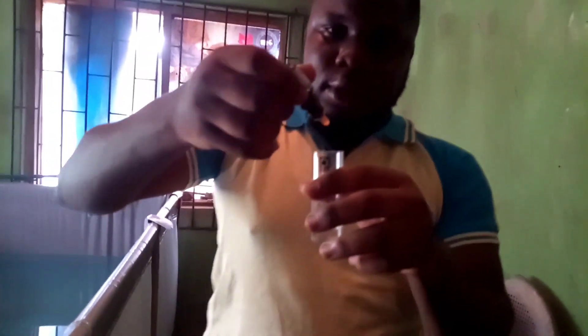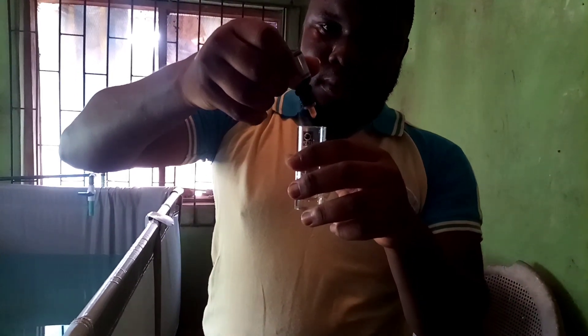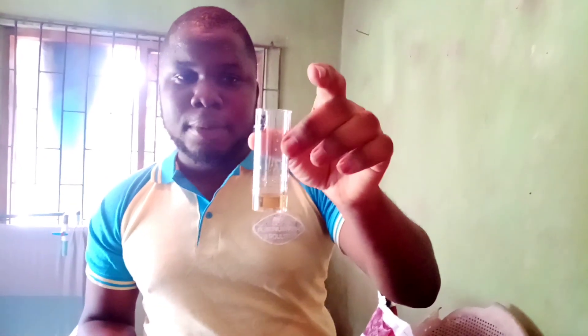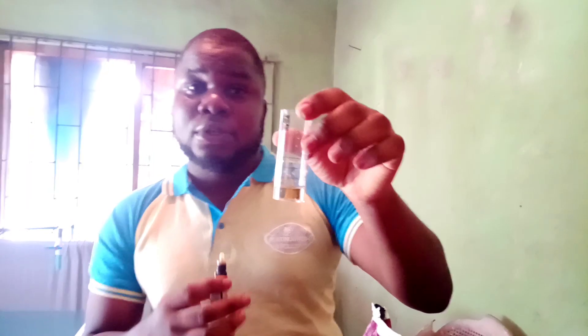I'm going to put just 4 drops — 1, 2, 3, 4. Four drops. Then I will shake it. I'll leave it for about 3 minutes. Whatever color it produces, I'll check the chart and see how it looks.